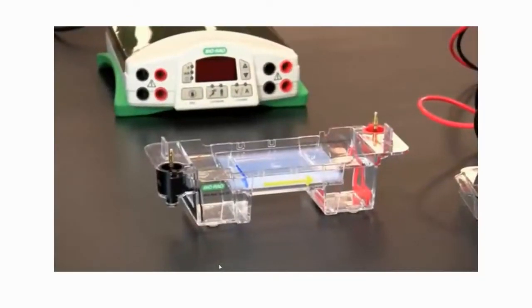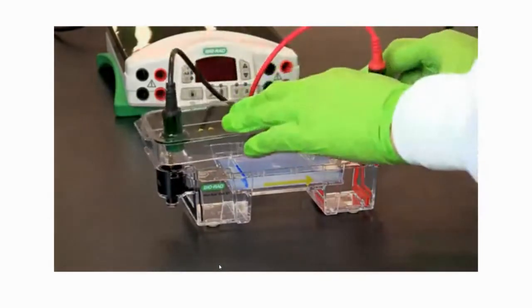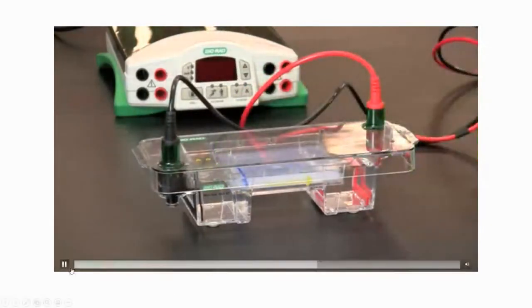Once all the samples have been loaded, avoid any bumping or movement of the gel chamber. This might result in the sample spilling into adjacent wells. Place the lid on the gel chamber with the terminals correctly positioned to the matching electrodes on the gel chamber.